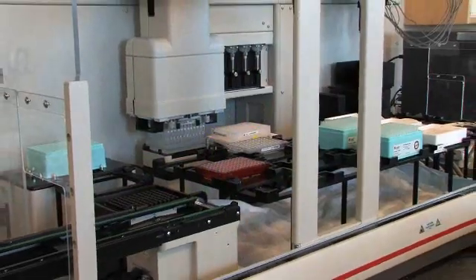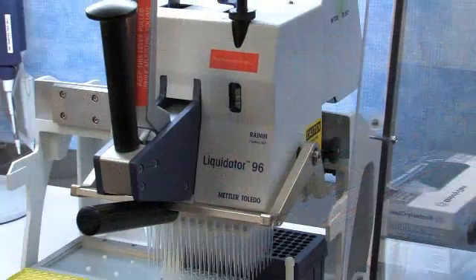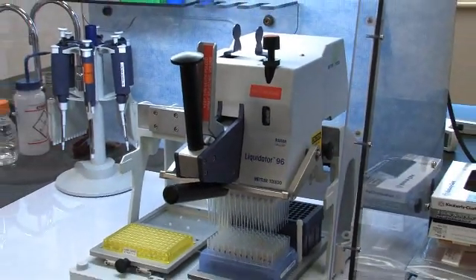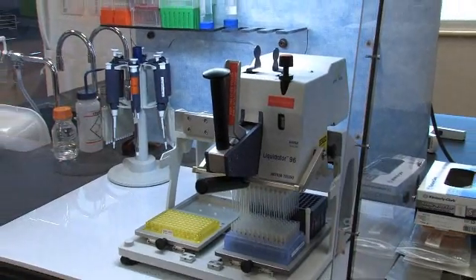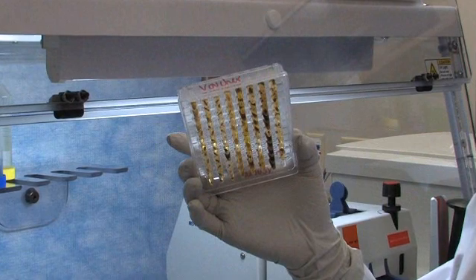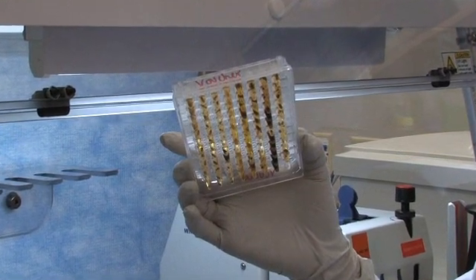First, we'll demonstrate DNA extraction from an animal sample on a robotic platform. For robotic DNA extraction, the liquidator 96 is used to set up the sample plate prior to moving to the robotic platform. The samples are incubated overnight in the presence of lysis buffer and proteinase K at 56 degrees Celsius.